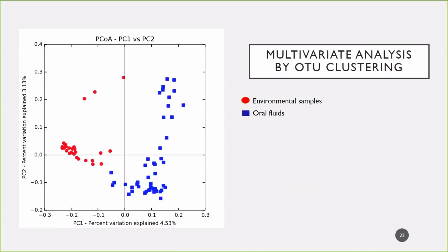And lastly, we wanted to look at how the environmental samples and the oral fluids compared in terms of clustering. So the red circles are the environmental samples, and the blue squares are the oral fluids. And so this multivariate analysis here is just showing that the environmental samples as well as the oral fluids cluster differently, and this is based on an OTU clustering, so on the operational taxonomic unit. And we defined an OTU as a specific segment from a different strain of influenza A virus. And you can see that there's a difference between the OTUs that were picked up between the environmental samples as well as the oral fluids. Next slide.